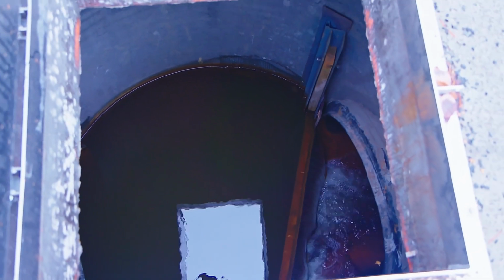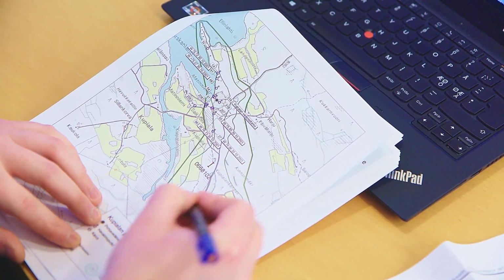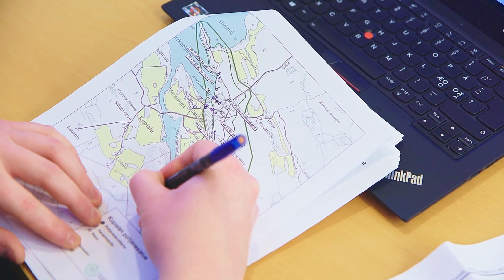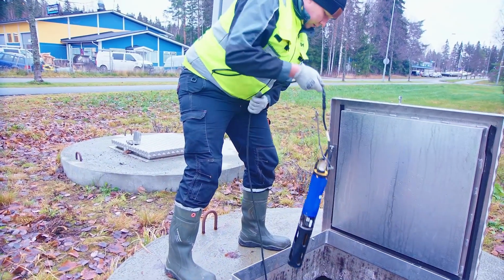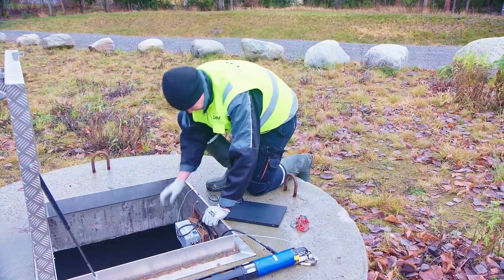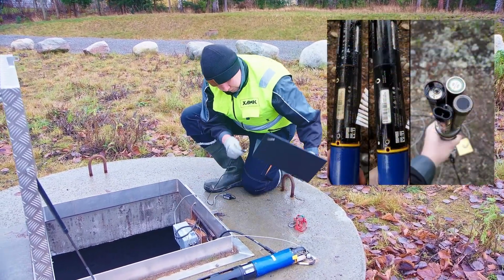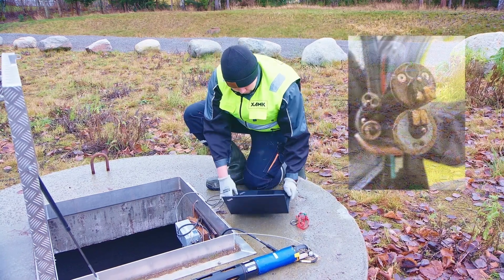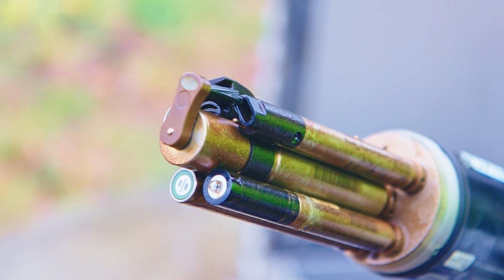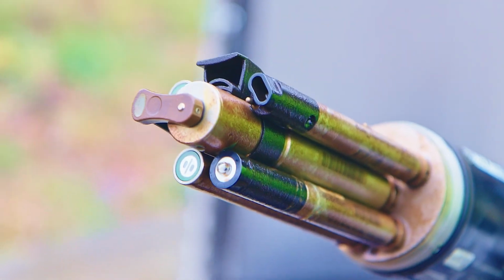Since the meters remain in a fixed target location for weeks or even months, the choice of measurement location has a direct effect on the representativeness of the results. The devices are also often left unguarded, so they should be protected, both from nature and from vandalism. Since continuous meters are used in the same location for long periods of time, their regular maintenance is particularly important. Natural waters often contaminate sensor heads, which may decrease measurement accuracy. Some meters also come with automatic cleaning brushes to prevent contamination. Despite cleaning brushes, the devices should still be maintained regularly.